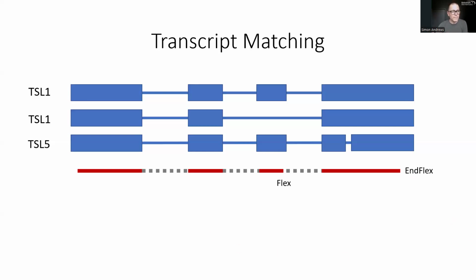What we can see here is that there is a very clear match between this splice form in the data and the first isoform in the annotations, and that this runs right from the start to the end. So this would be a full match of this read against that isoform. If we look at another read in here, we can see that we have a shorter read, which starts in this second exon, and we observe the splice through to the final exon, and we see a single match over here.